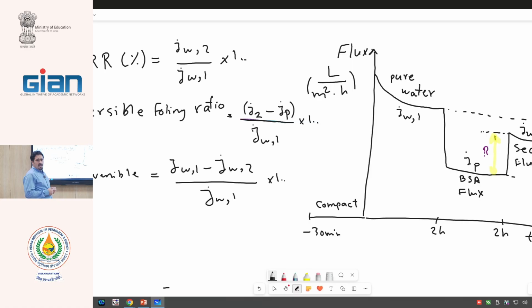And in every test, when we want to measure the salt rejection, dye rejection, every rejection, we first compact with pure water flux, and after that, we replace it with the separation, heavy metal solutions, okay? But we have two series, one series for the BSA fouling test, and the second for the separation test. Okay. We can go to the slide.